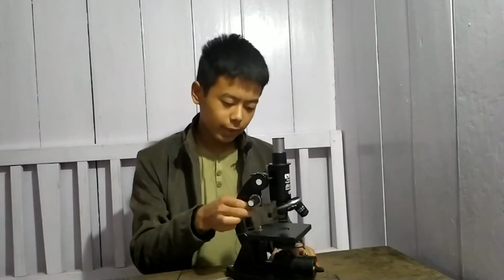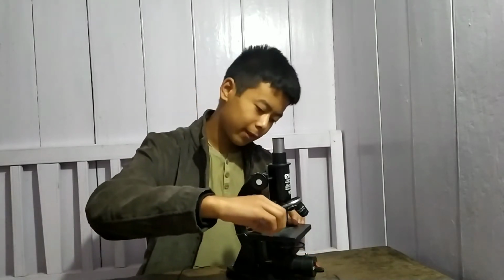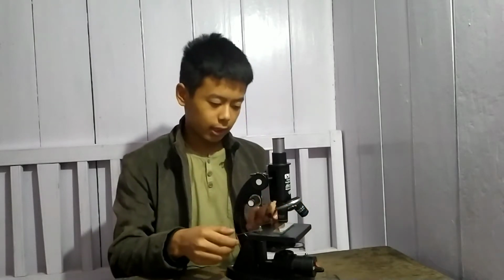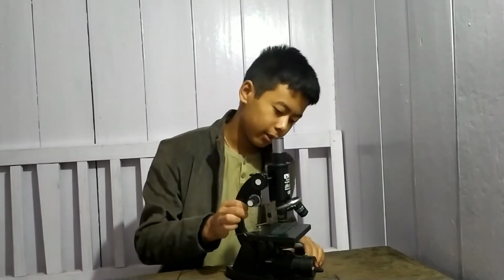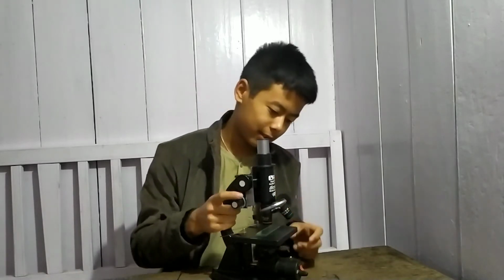Oh, by the way, I haven't told you the scientific name. So the scientific name of this organism is Ctenocephalides canis. So yes, you can see that it has the species name canis because it kind of looks like a dog, and it's also commonly found in dogs and cats.